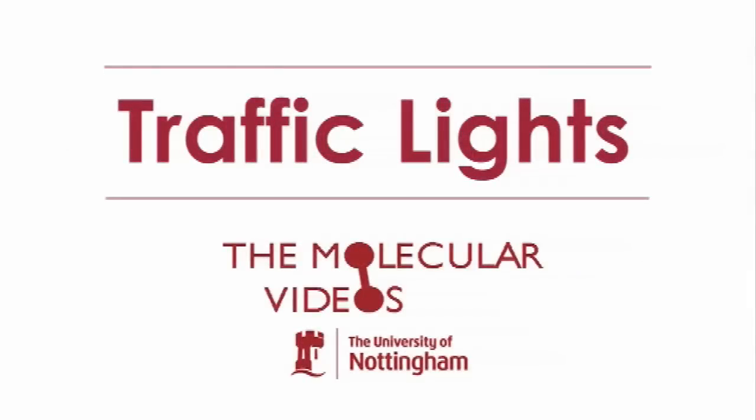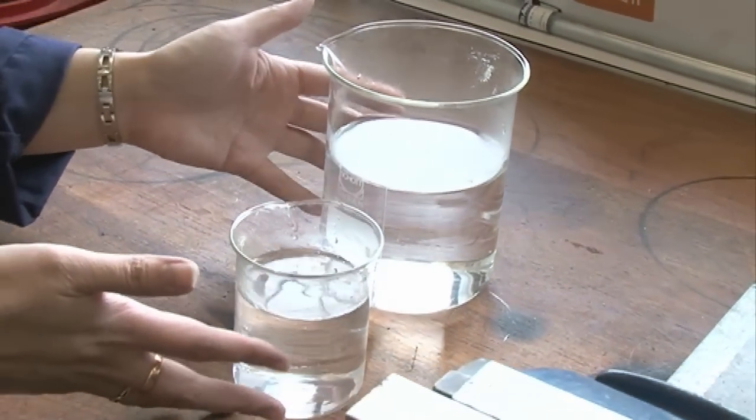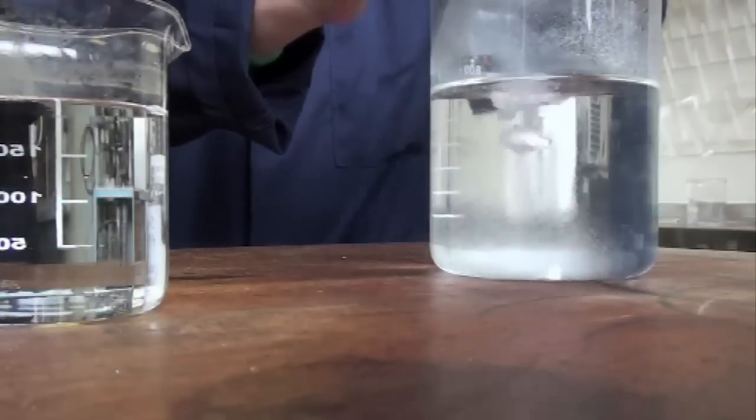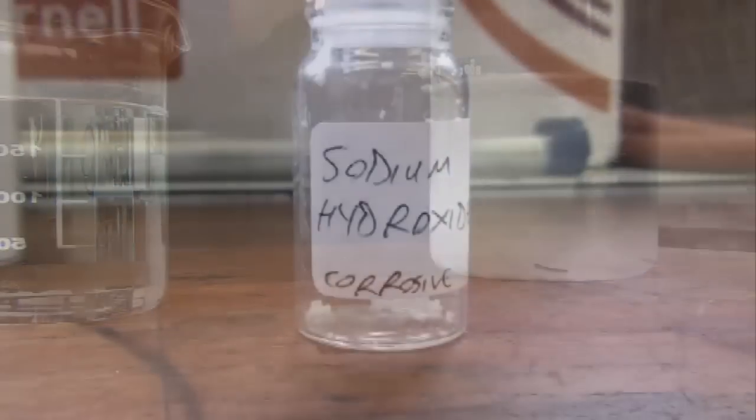What we've got here is some hot water and cold water, that's all we've got at the moment. We're going to add glucose, a type of sugar, into this one and sodium hydroxide is going into this.